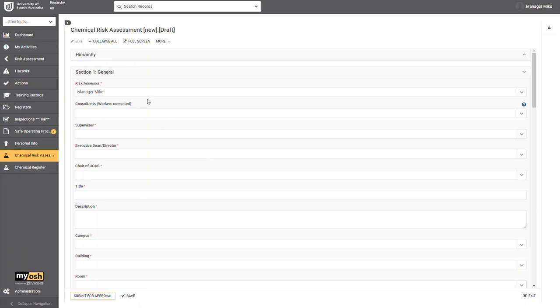So once you've completed all of the fields, the mandatory ones marked with the asterisks at a minimum, and all of the others that you need to, what you'll do is you'll click on the Submit for Approval button, and this will then send it to the pending Supervisor Approval step. Notifications will go out. These are things you don't have to worry about. They will happen automatically.